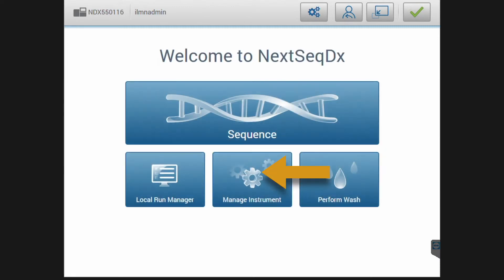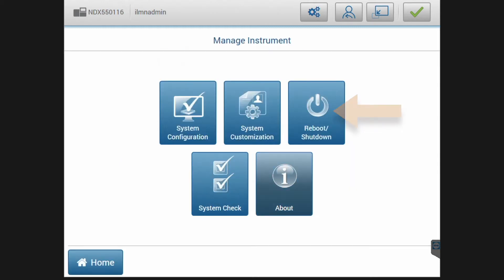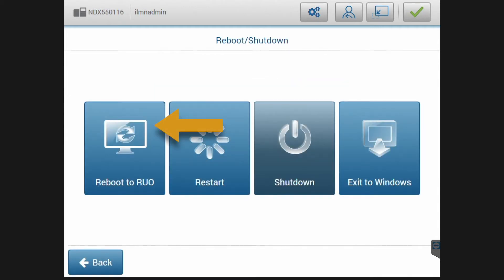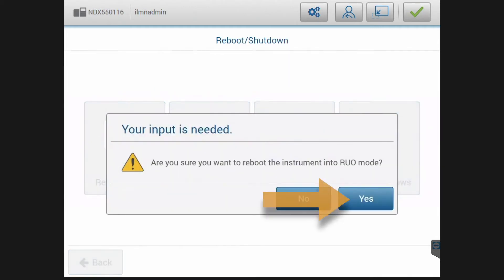please navigate to the Manage Instrument menu in the NexSeq DX control software. Once in the Manage Instrument menu, please select the Reboot shutdown submenu. Select Reboot to RUO and confirm the reboot in the pop-up notification.